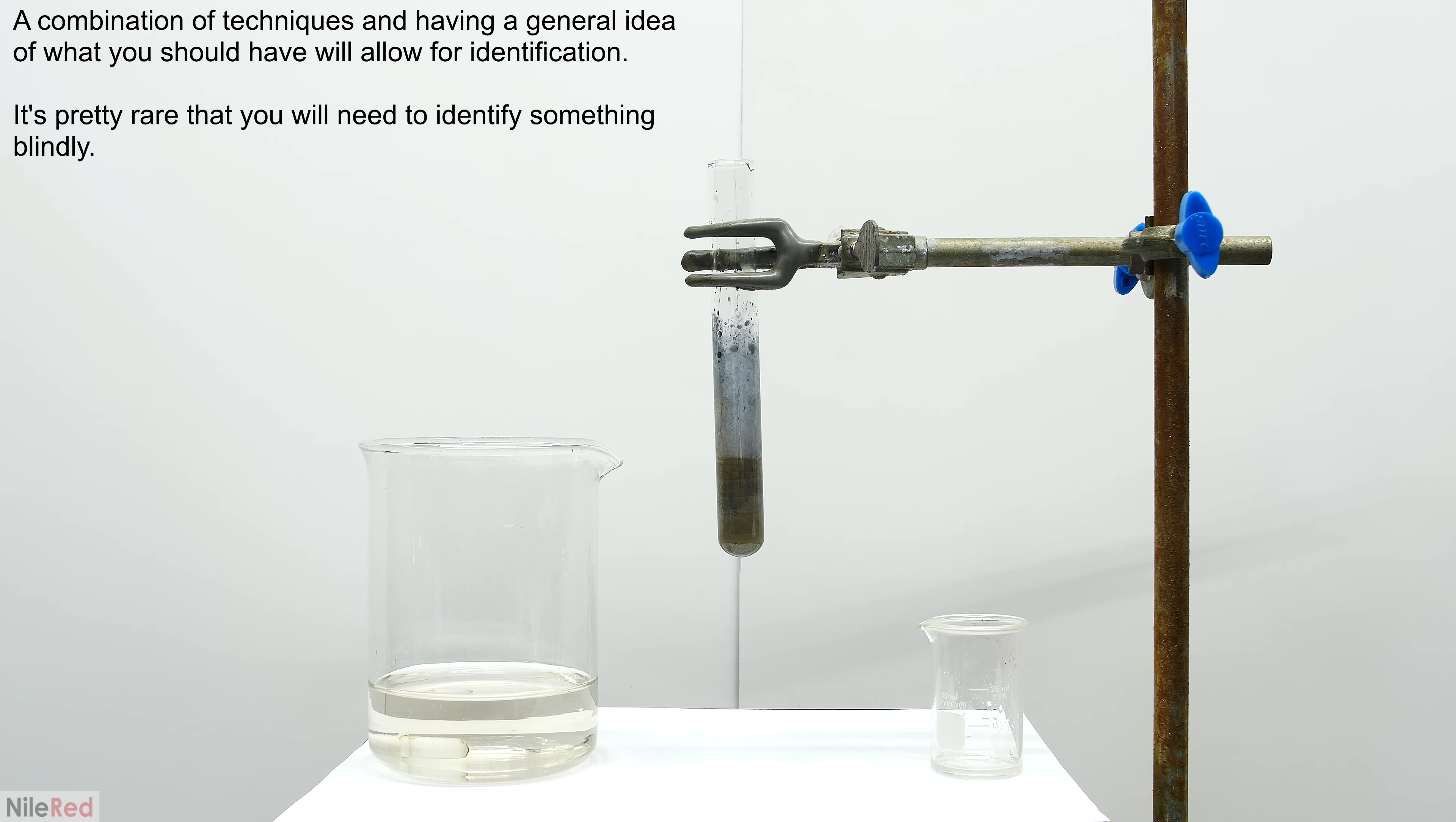It's important to note that I said it only suggests that an aldehyde is present, and that it's not for certain. This is because the Tollens reagent isn't a hundred percent specific for aldehydes. The Tollens test will also give a positive result for things like alpha hydroxy ketones, and even some odd false positives for things like formic acid.